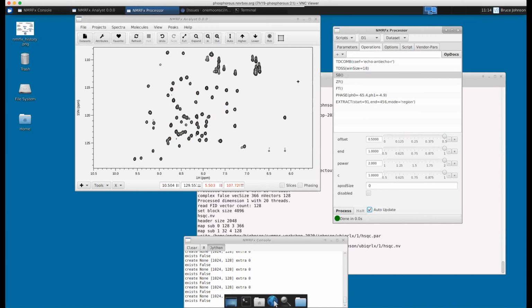So let's just pause there. I'm going to go on and process a 3D NUS spectrum in a second, but basic processing questions. Anybody wants to throw their hand up? I think we've kind of hit most of the features there.